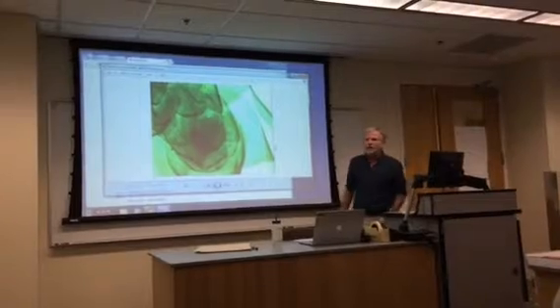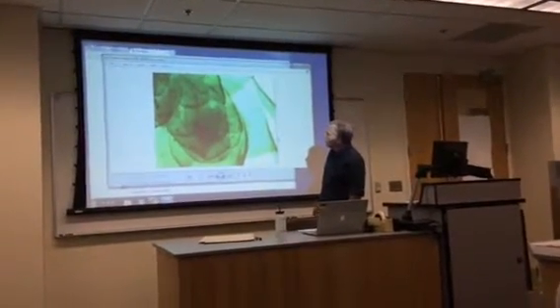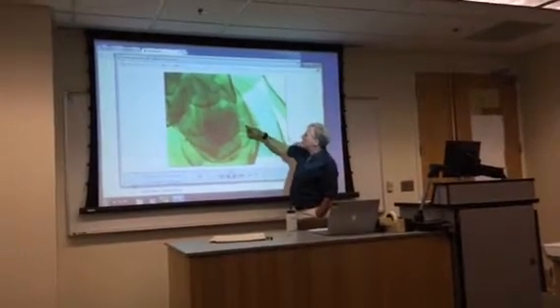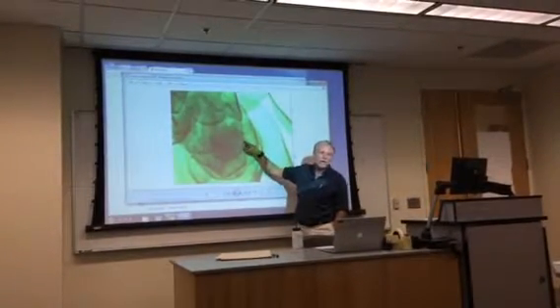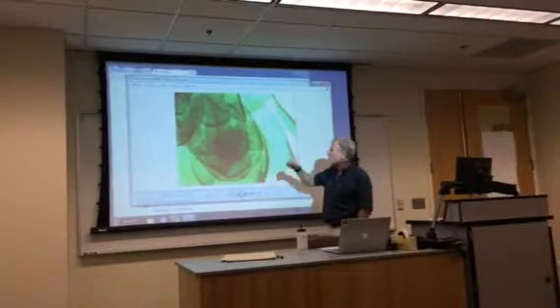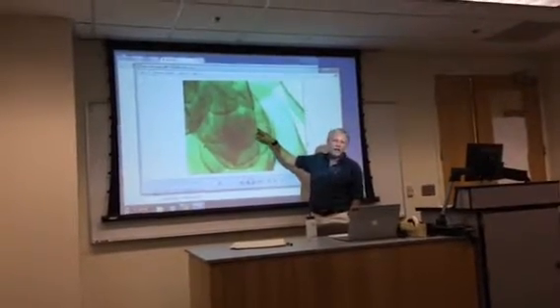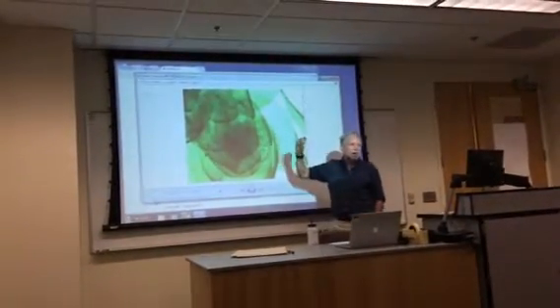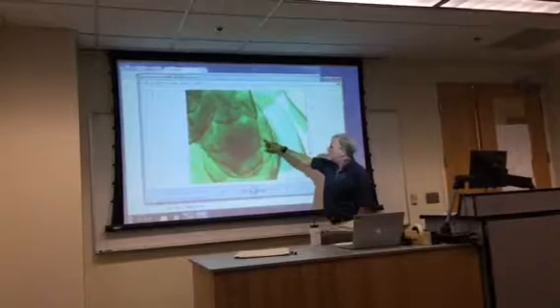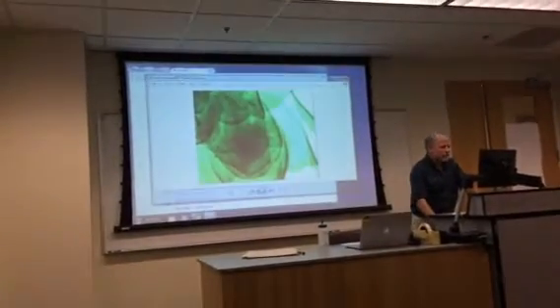Here, doesn't that look like emeralds, right? So here's a whole mound, the whole thing you're looking at. You're looking right through it. It's hard to see, but here are these little pointy structures. Those are archegonia. And these leaves are the gynoecium. They're covering the tip of this branch, and that is keeping it moist and facilitating the sperm swimming in there. So when you're looking at a whole mound, focus up and down. As you focus through this leaf, you'll see the archegonia come into focus there.